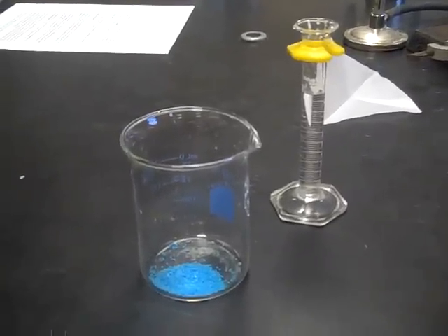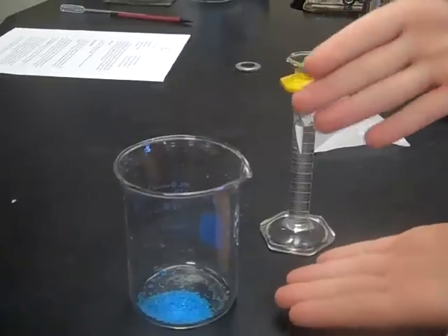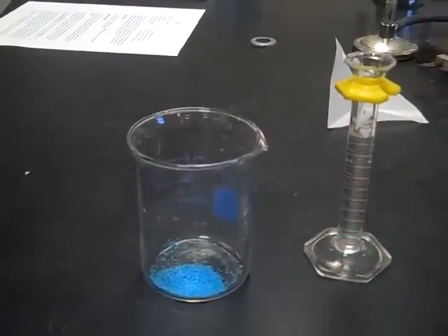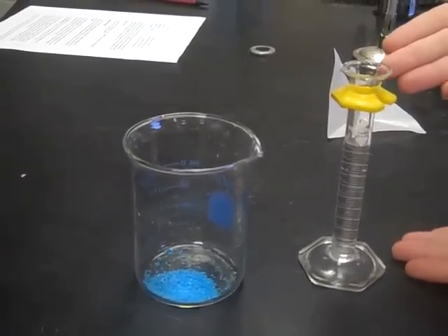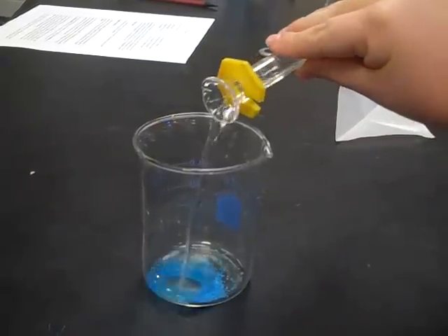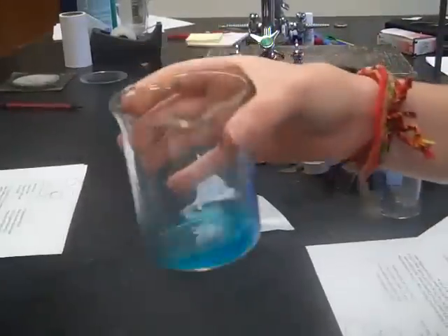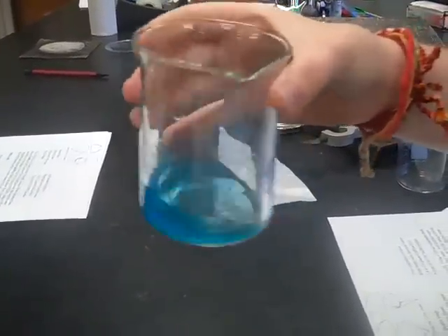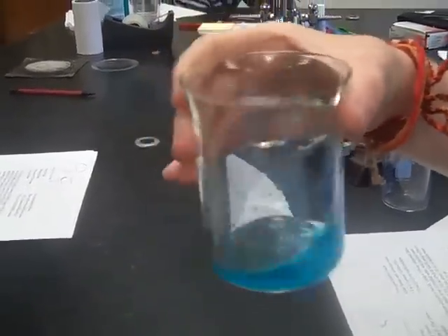This blue crystal collection is 2.03 grams of copper 2 sulfate pentahydrate, and we also have 10 milliliters of distilled water. We are going to combine these two in a 250 milliliter beaker. The copper 2 sulfate pentahydrate is being dissolved in the distilled water in a 250 milliliter beaker.